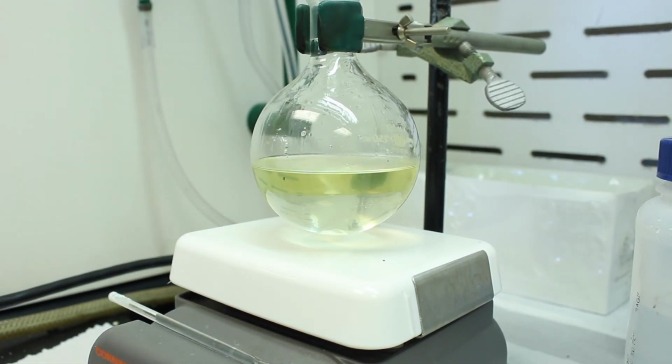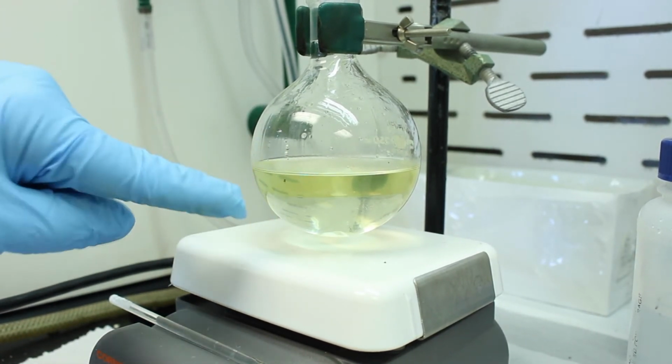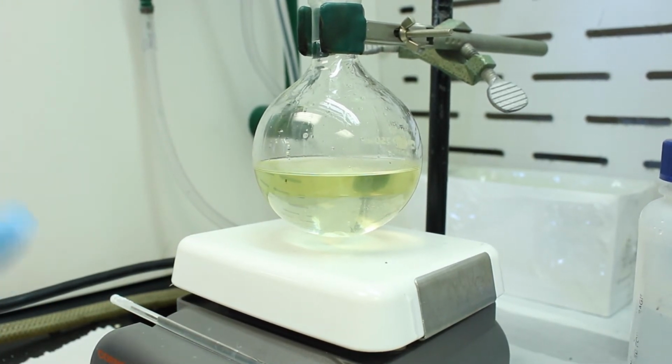But the other yellow color that it could come from is the biphenyl. The biphenyl is slightly yellow, so that could be it. And you'll notice there's a little bit of fizzing at the interface, and that's from the magnesium being dissolved by the HCl. So we'll let this stir for a few more minutes, and then we'll separate the layers.